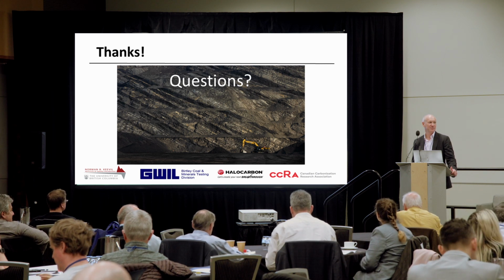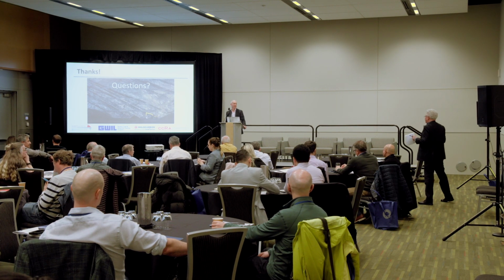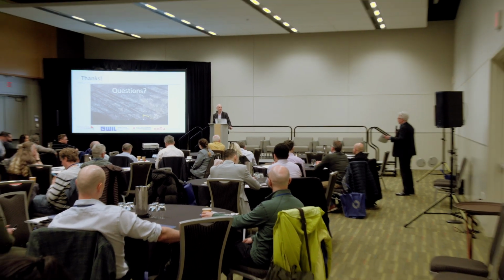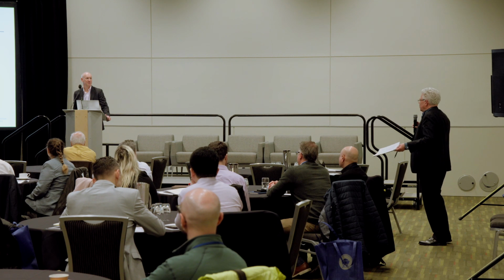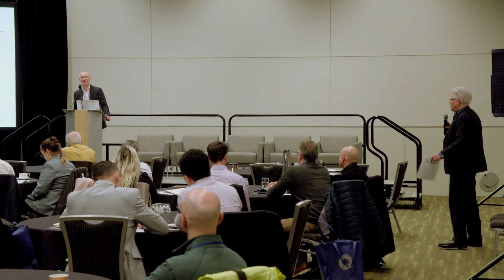Thanks, Jason. That was very interesting. I'm going to start on the more granular, because once we get on to the coal is great, we'll then go off to lunch. Just on the very granular side, very interesting research. That chlorine issue was a kind of out of left field. Is it possible to use those liquids for everything you need them for, and then just do a workaround on the chlorine, like just work with the raw sample rather than run through those samples, or just get your chlorine out otherwise and then use the rest?